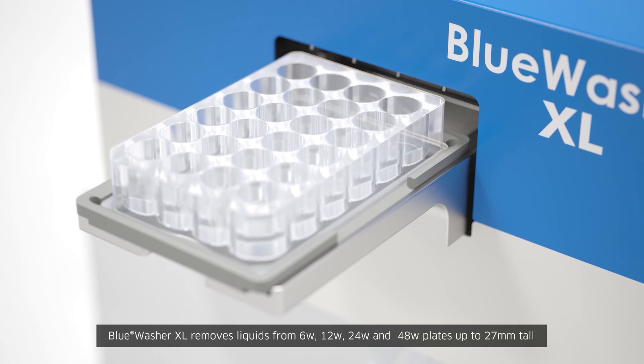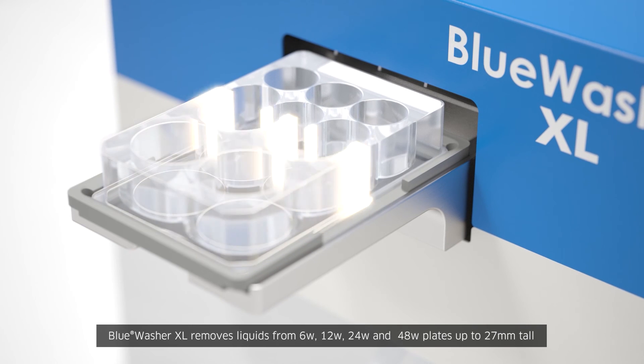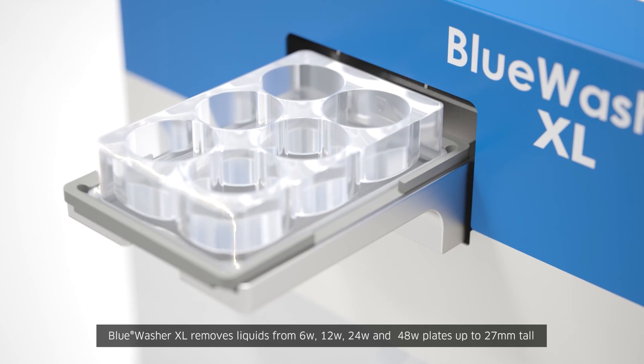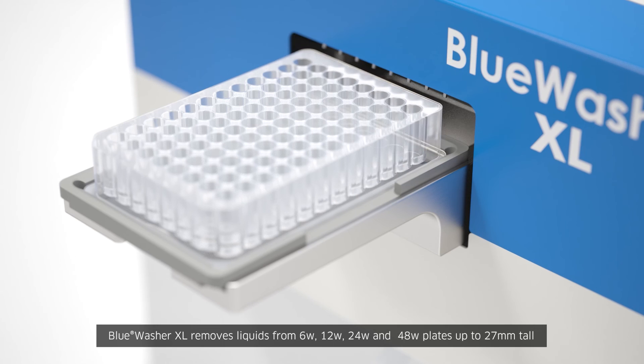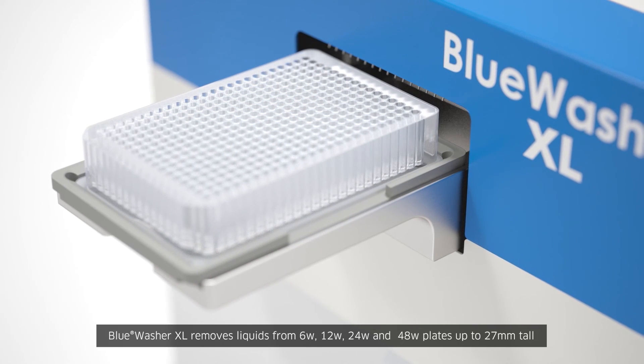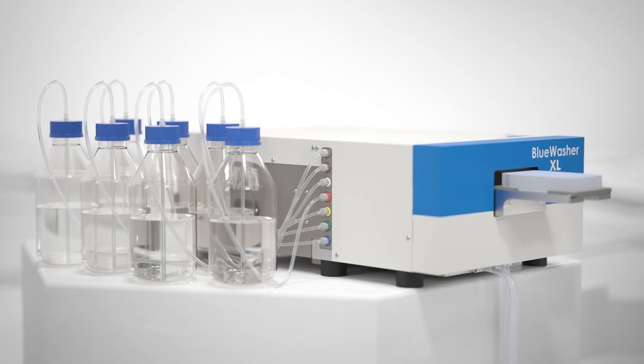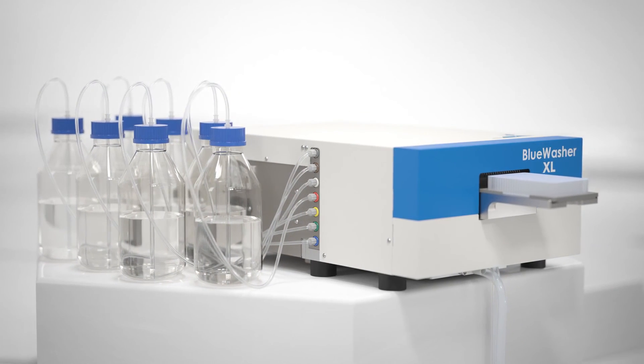Blue Washer XL is designed for taller plates in applications such as 3D cell assays or higher volume magnetic bead plates. Blue Washer XL also runs taller 96 or 384 well formats. Welcome to the next generation Blue Washer.